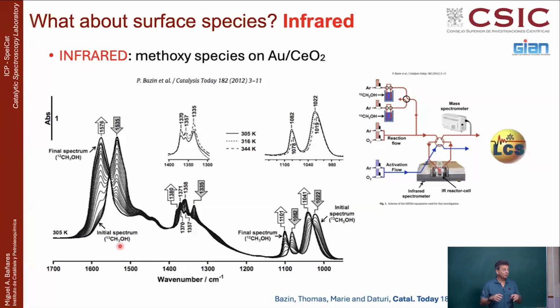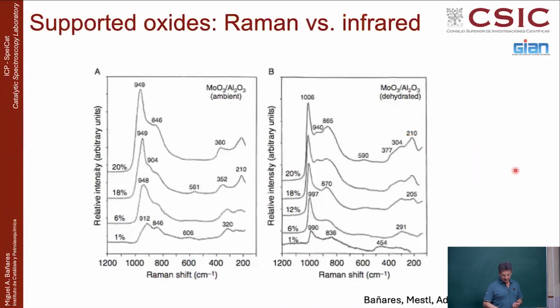The nature of the carbon deposits is actually that you get some polyolefinic species and you get oxygen-containing species. And if you're only using one of these techniques, you will only get part of the reality. And you will make a story based on biased information. So you will be biased because experimentally you don't see everything. So that's why this is very important. And we typically collaborate with the group of Marco Daturi in France, at the Laboratory of Catalysis and Spectrochemistry, where we do a lot of complementary studies with Raman and infrared.